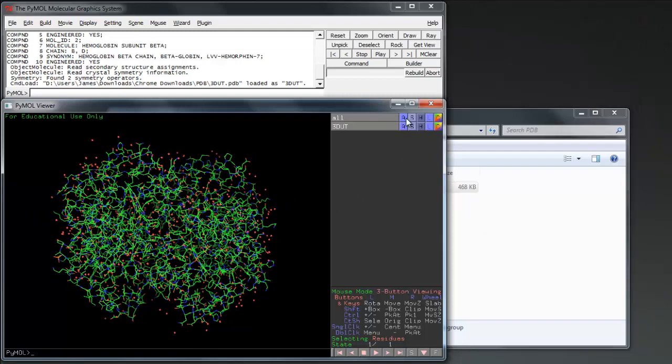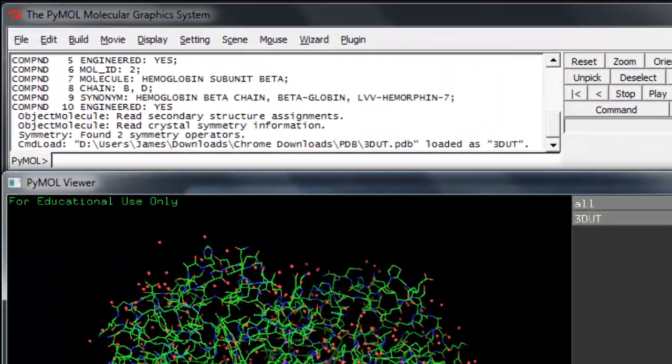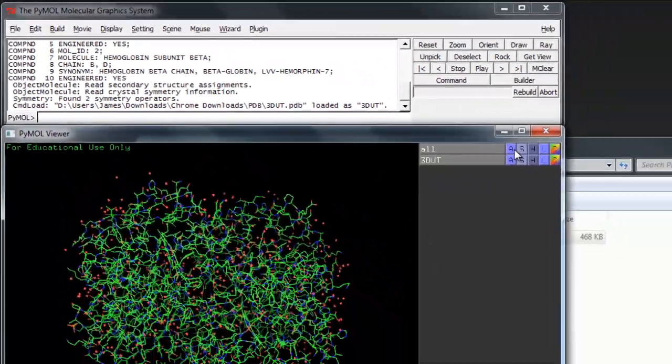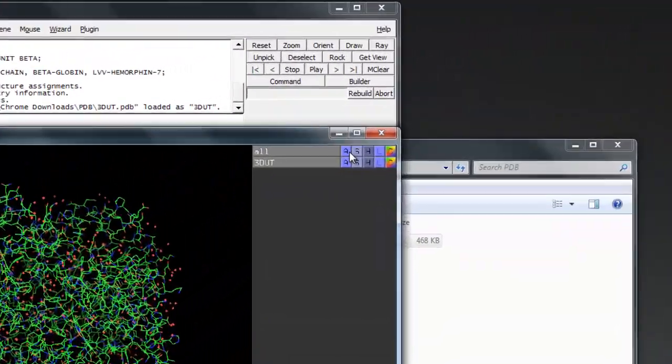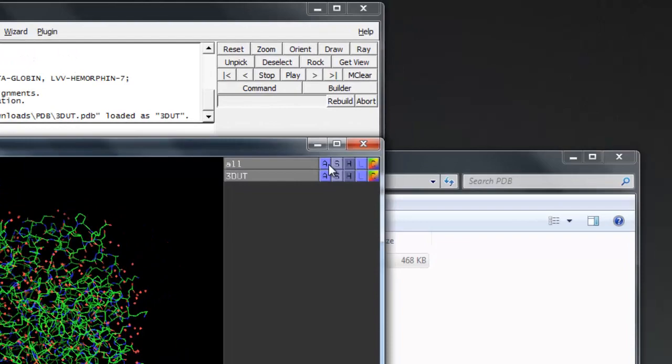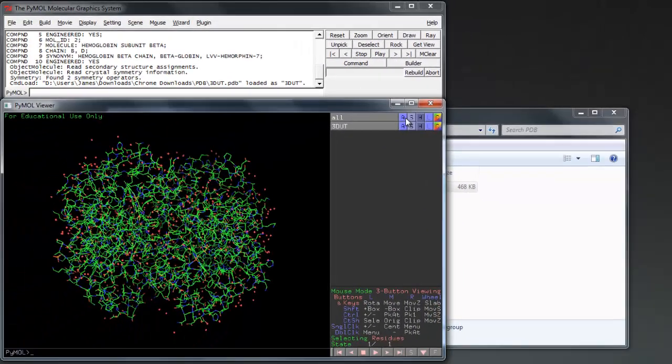There are two ways to input commands into PyMOL. The first is via the command prompt at the top. The second is using the visual user interface at the top right, which is what we're going to start by using.